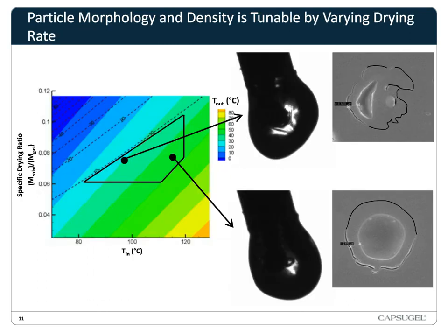Okay, now this slide shows some different particles, how we can start to engineer the morphology and things like wall thickness of the particles. Now, there were a few videos in here, and unfortunately we had some technical issues, so I won't be able to play the videos. But what the video showed on the top was a slow-drying droplet on a stick.